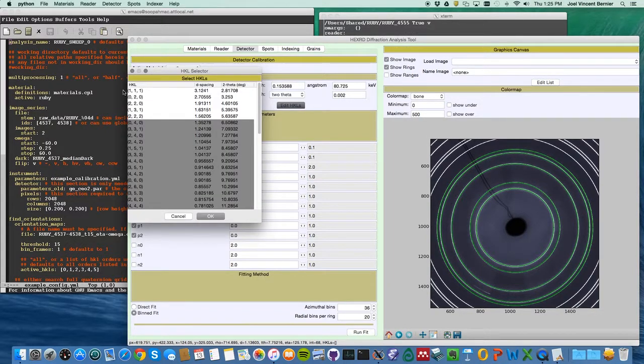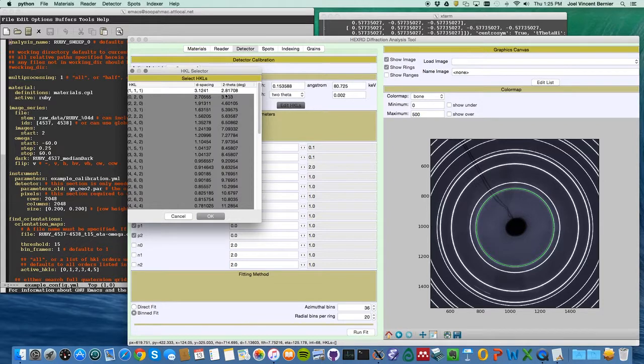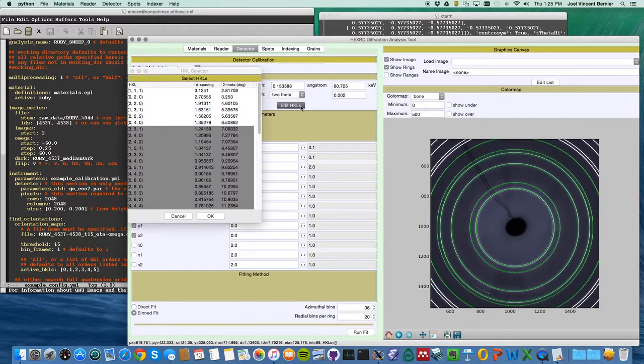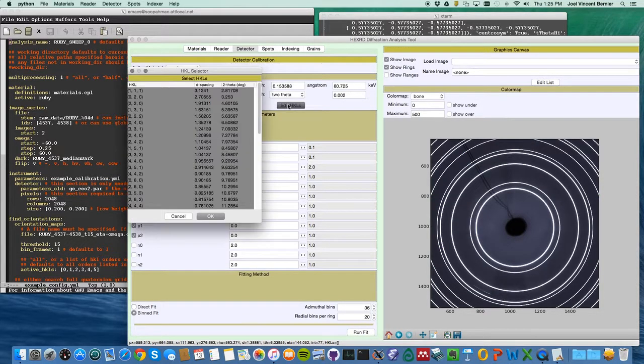Now if I open this editor, I can select one ring, and you'll see it would be just that one. Typically doing the first 5 in this case is good. We can do the first 6 if we want. You can shift click and control click here. If you open that and you don't want to change things, just hit cancel, because if I hit OK, notice no rings are selected because I didn't select any.